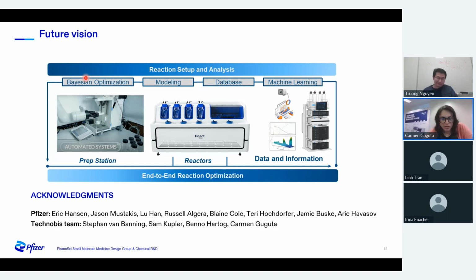One more question, Trong, and then we try to finish. Do you feel that the small scale allows for meaningful workup and physical yield determination? Probably meaningful in terms of generated kinetic data.